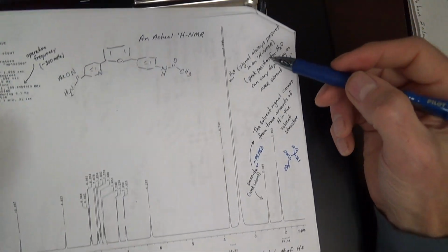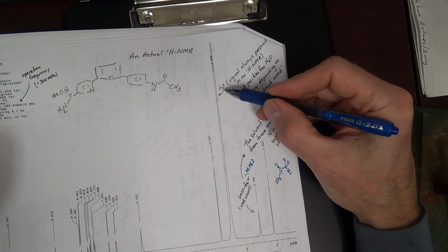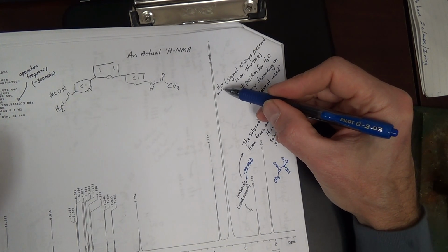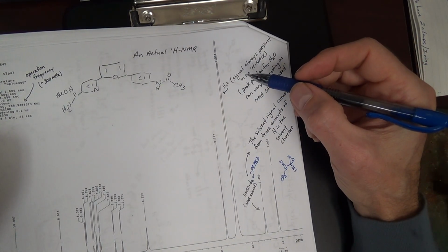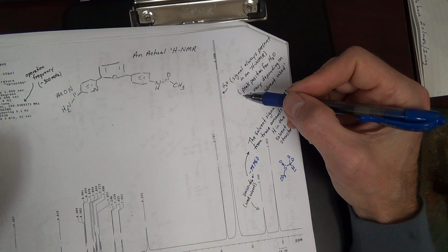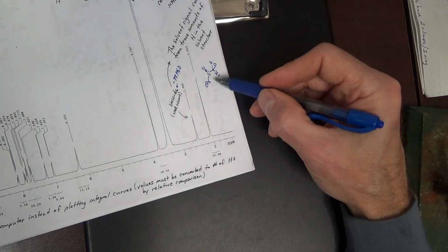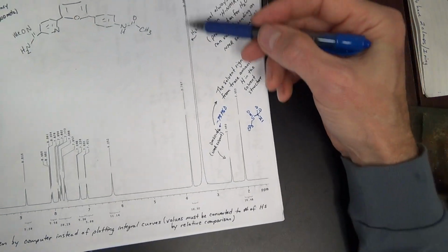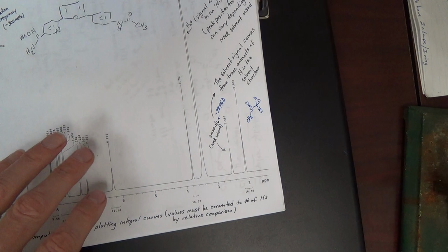We also have water in a real NMR. Water is everywhere, including in the atmosphere in which the light is traveling through. It gets absorbed by your compound, but it can also be absorbed by water that's just in the atmosphere. There's also probably water in your DMSO because it's a very polar solvent, and so it's not 100% dry. Water will give a signal. In DMSO, that signal is about 3.3 ppm.